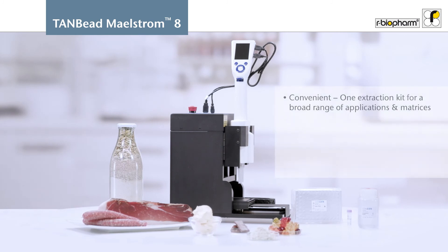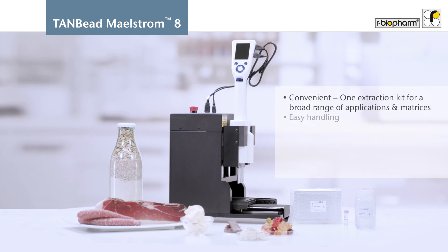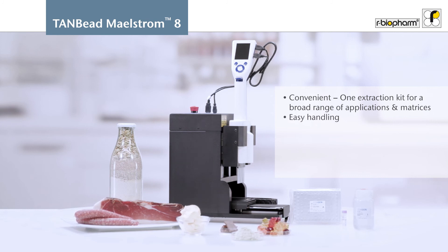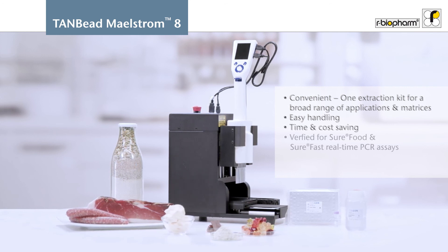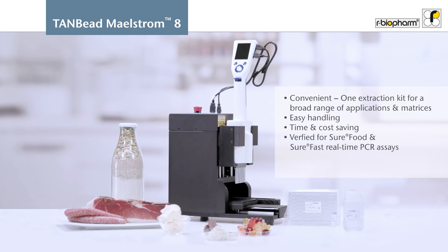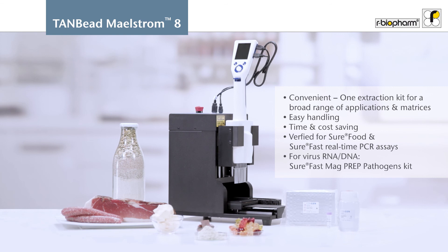Arbiopharm's semi-automated nucleic acid preparation solution is ideal for routine lab work with low to medium sample throughput. It enables reproducible extraction and consistent recovery of nucleic acids from a broad range of matrices. It saves manual hands-on time due to the unattended workflow and is cost-effective.